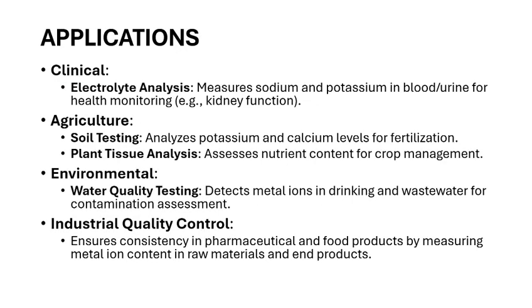Now, coming to the applications. Clinical, for measuring sodium and potassium in blood or urine, aiding in health diagnostics. Agriculture, soil and plant tissue analysis to optimize fertilization and crop management. Environmental, assessing metal ions in water for contamination control. Industrial quality control, ensuring consistent metal ion levels in products like food and pharmaceuticals.